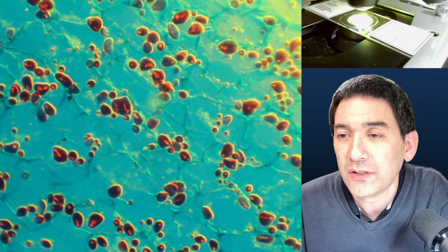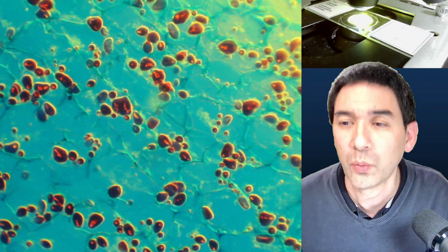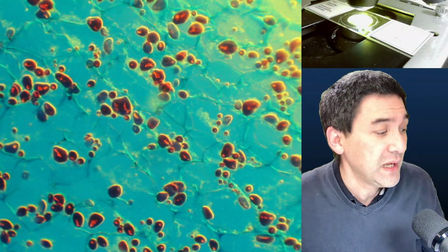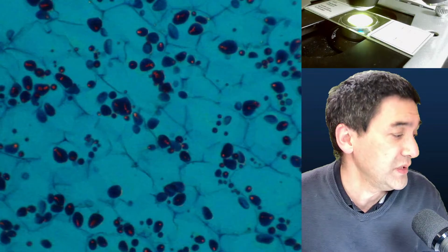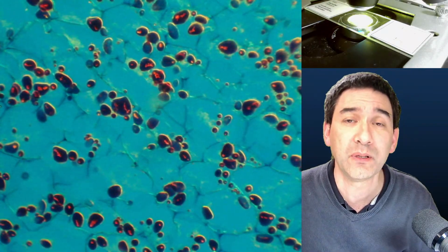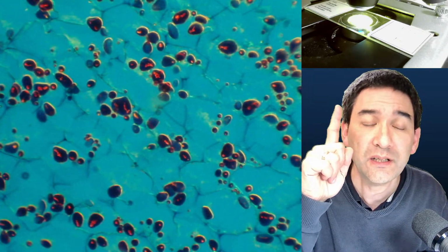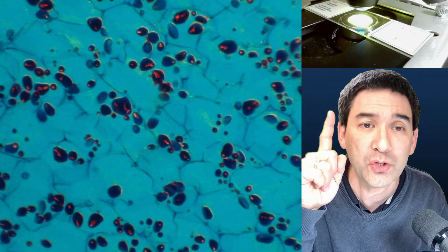Okay, so there is a question here. Do you have any experience using filters with ultra long working distance condensers? Unfortunately not. But I can tell you that the position of the condenser is quite important. I can actually try to show this to you. If I, for example, lower the condenser here, right? You see that this has a significant impact on the image quality as well.